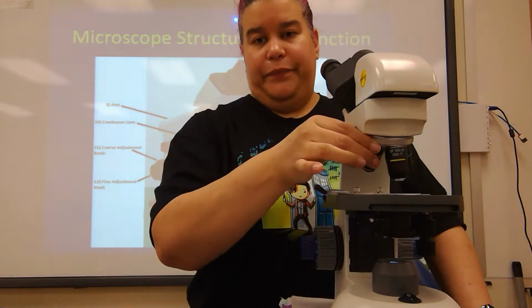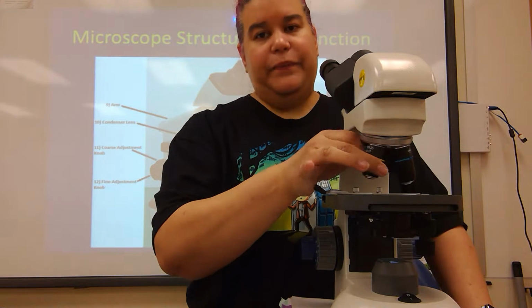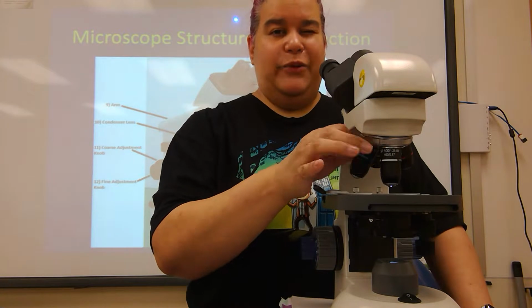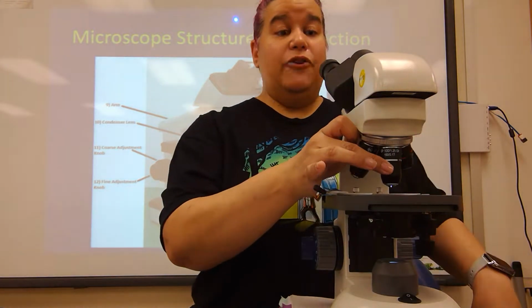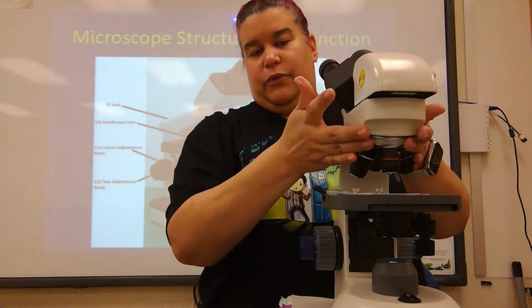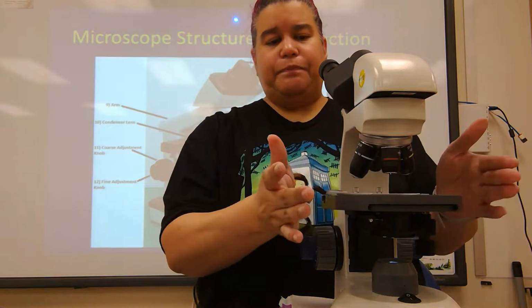The next one is 10x, 10 times what my naked eye can see. The next one is 40, so 40x. And then the last one, which is a very special one that you only use under specific conditions, is the 100x. Okay, so you have oculars, the revolving nose piece, the objectives, the stage.